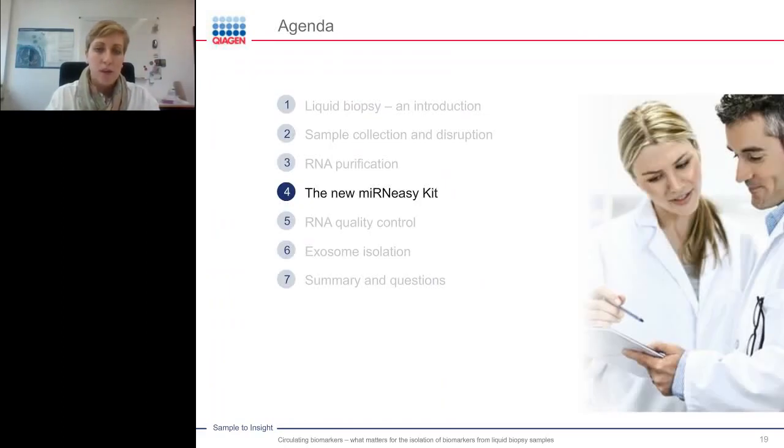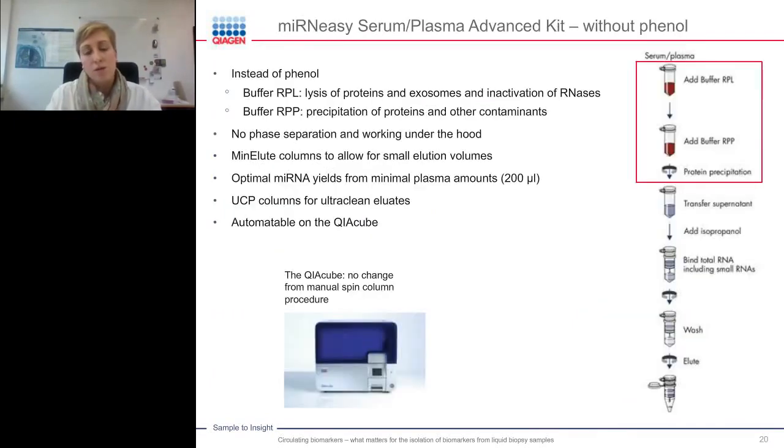What is usually a very good way to inactivate RNases and also to remove contaminants is a phenol-chloroform step. That's why a lot of our kits are still containing a phenol-chloroform step.